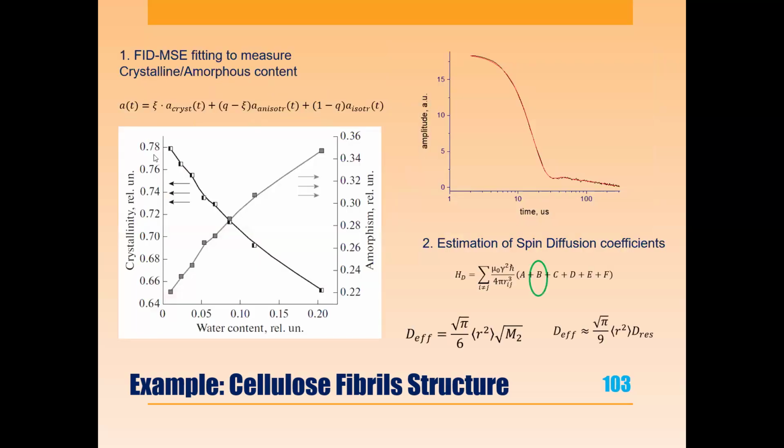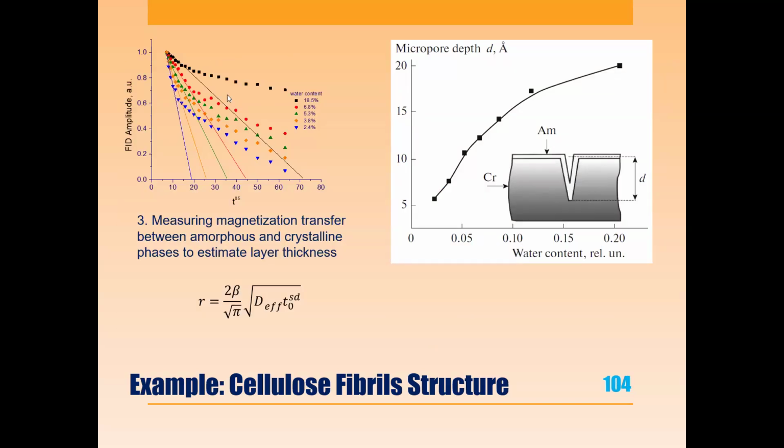And you see here the crystallinity goes down, amorphicity rises. And the next experiment, which is absolutely different and uses absolutely different physical phenomenon, tells us that this distance towards the slit pores is increasing. So it means that when water arises, it penetrates inside and makes additional strain within the slit-like pores, and these pores become deeper.